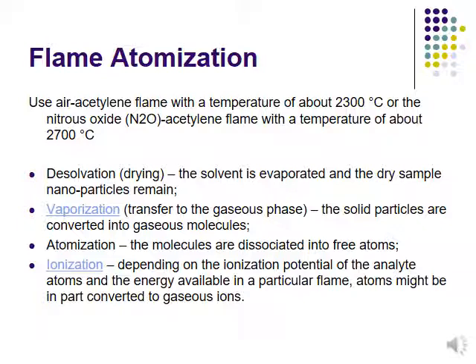It will depend on the analysis, on whether the sample requires a very high temperature or an optimum temperature. So basically, we will have about 2300 degrees Celsius for the air acetylene flame, and the nitrous oxide with acetylene flame requires about 2700 degrees Celsius.